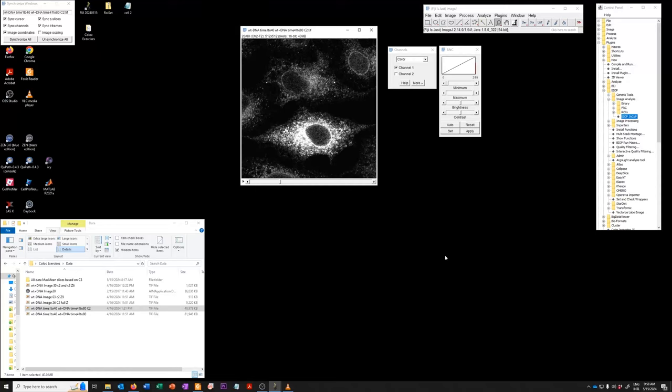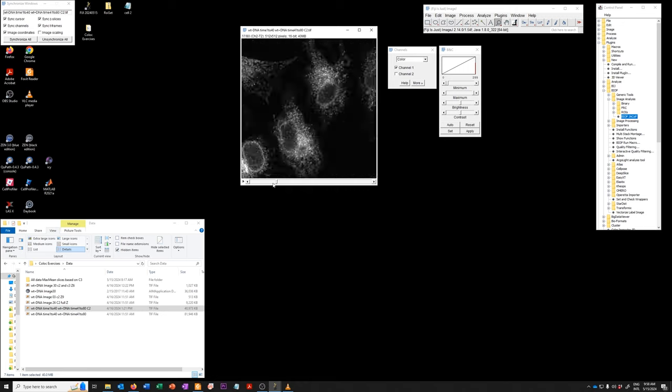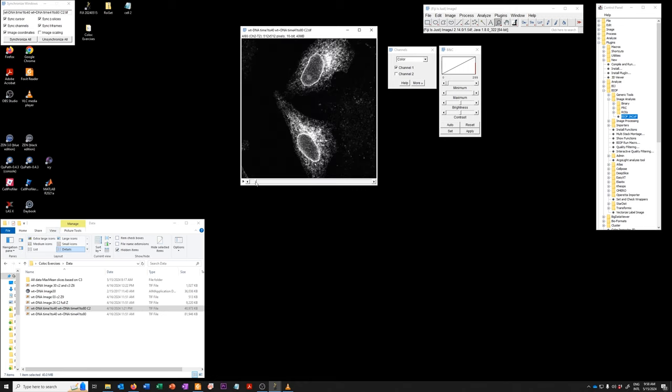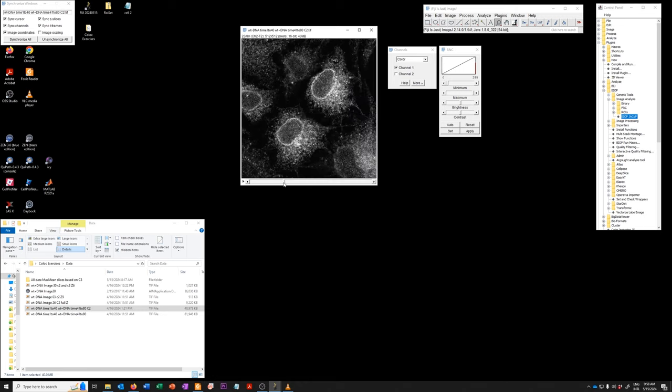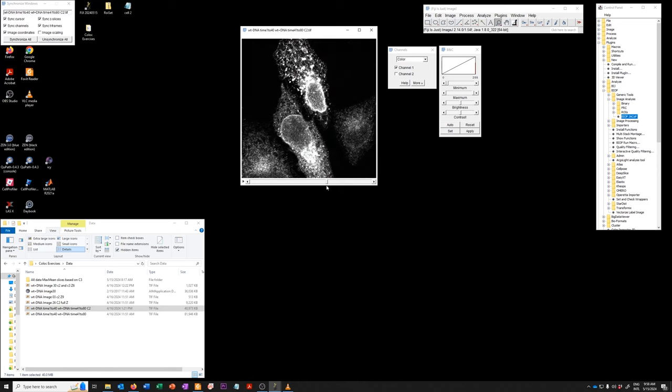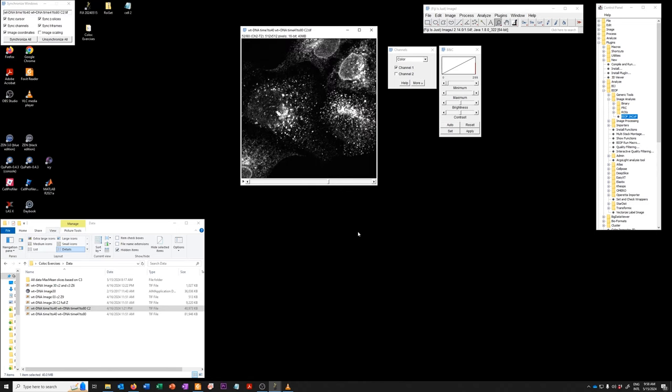This is an optional exercise related to exercise 8, using multiple images to explore thresholding options. What I want to show you in this optional exercise is how you get from individual data files to this concatenated image stack, which we saw was so useful in the exercise.